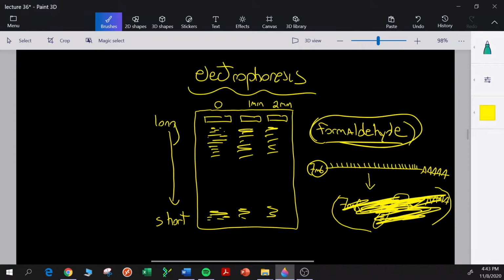But eukaryotic cells make a whole lot of a few RNA molecules, right? The ribosomal RNAs. So eukaryotic cells have tons of that. So we should see some pretty intense bands corresponding to the different size ribosomal RNAs. So I'm going to put 4 in here.